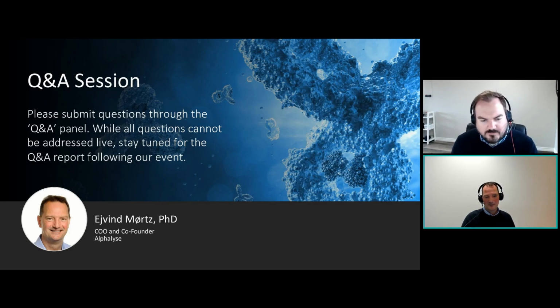Okay, wonderful. If you want a higher accuracy than this twofold median consideration, then if it's one specific protein that's of concern, we can do more accurate quantification. This requires you have this as a purified protein standard. Then we can make the exact calibration curve and response curve for this protein. This could be an enzyme that you add during your manufacturing process. It could be, for example, benzonase, if you use that in your process. So there are different ways to make it more accurate. So here I showed results from the generic method that's immediately applicable.